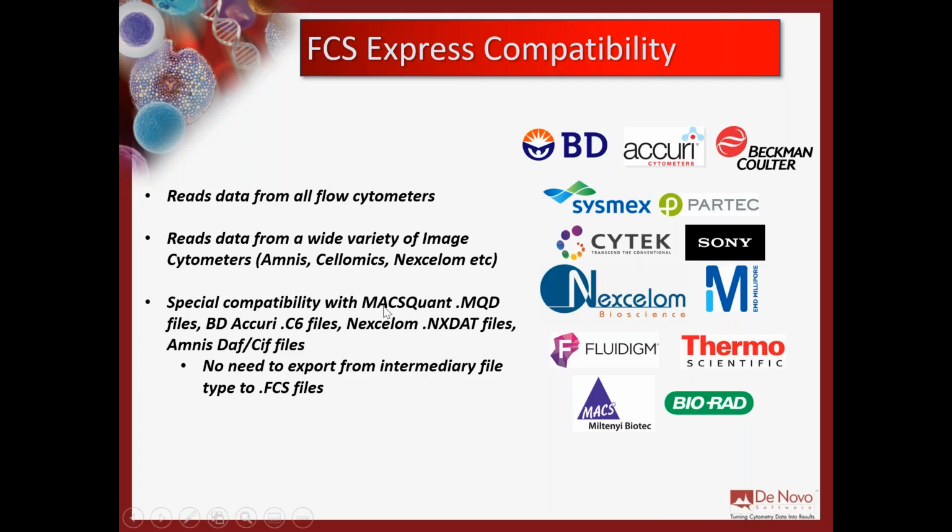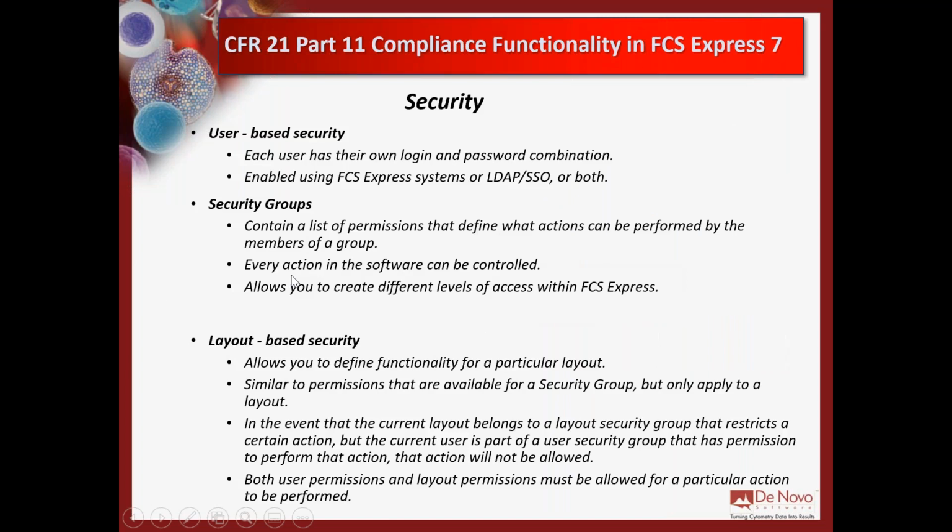These instruments that these files come from are excellent. I mean, of course, all of our partners and compatibility instruments are really great, but this really does help for a lot of folks using those specific tools. So let's talk a little bit about these add-ons in particular, and then we're going to jump into FCS Express, and we're going to go through some of them and how they work in context in the software.